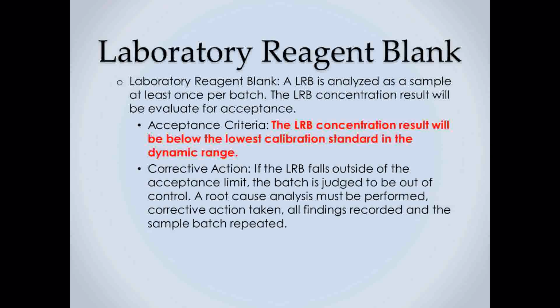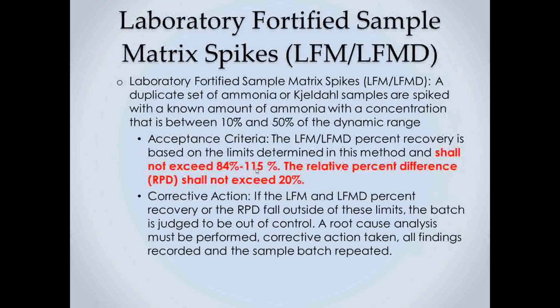Again, laboratory fortified blanks. We'll just go on to the next one. LFM, LFMD. Now, people may say, why is that 84 to 115%? We looked at the LFM and LFMD recovery calculations from the EPA formulas there in the guidance, and we decided that we'd rather have these just a bit tighter than some of the loose ends on it.